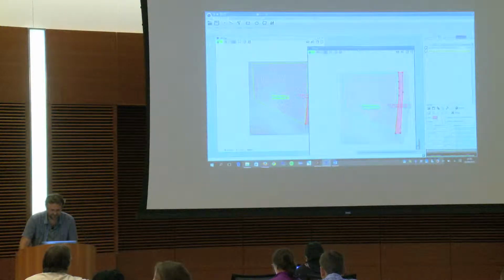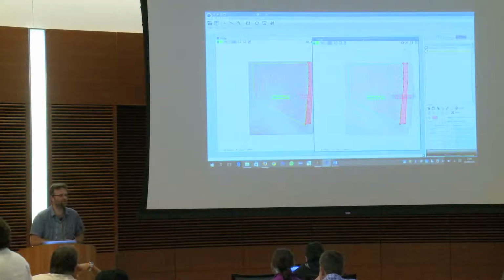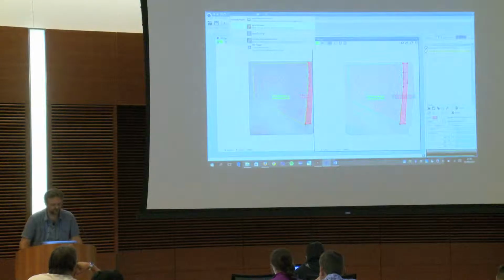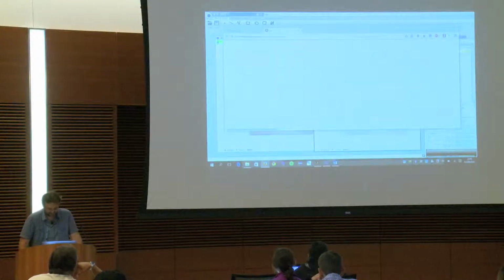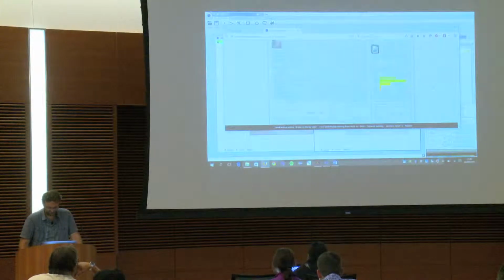You press Start Detection. In fact, the plugin is a big plugin. It's creating the result for you in an output folder. And if you want, by the way, the documentation of this plugin, when you type spot in here, when we launch the plugin, instead of left-clicking, you right-click. And if you do this, you go straight to the documentation that is on the website.